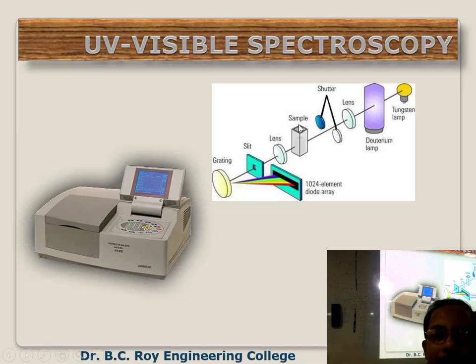Then you have the sample. The sample is kept inside a container called a cuvette.